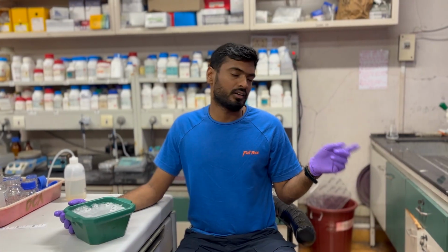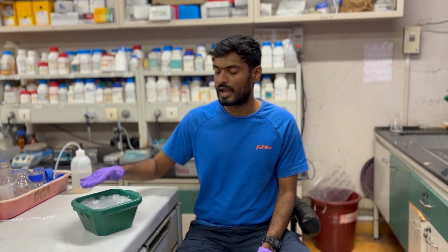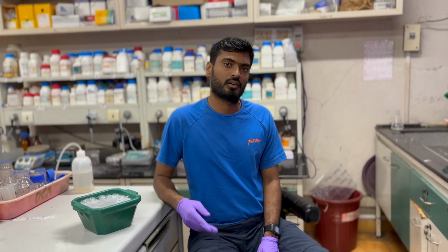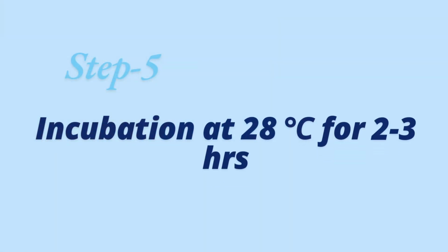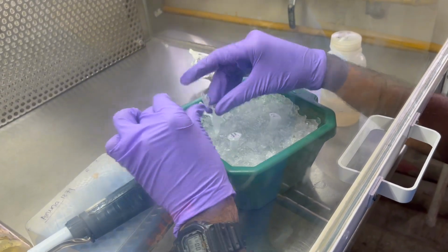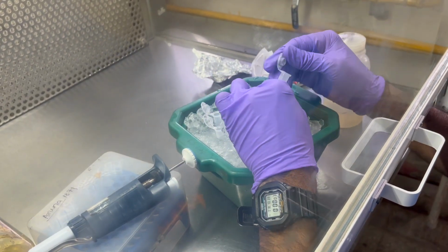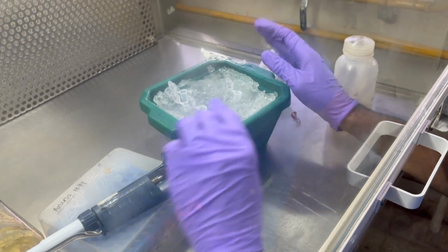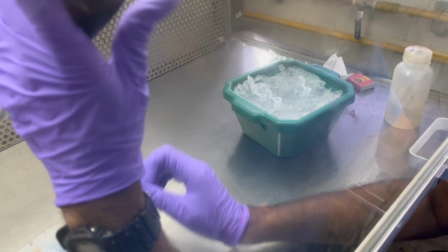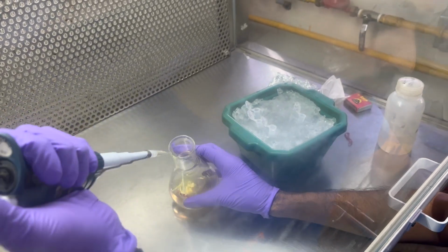After incubating at 37 degrees Celsius, we have to transfer the vials on ice for at least 2 to 5 minutes, and after that we will add LB broth. Now for the past 10 to 15 minutes, the bacteria have been undergoing a lot of stress. Especially we have frozen the cells, which disrupts the membrane. Again we have thawed the cells at 37 degrees Celsius for 5 minutes, making uptake of the DNA possible.